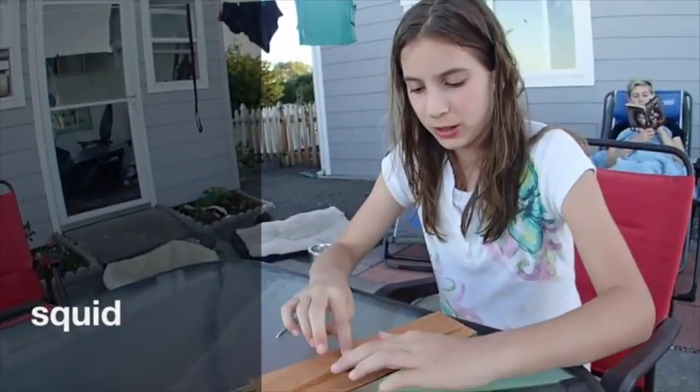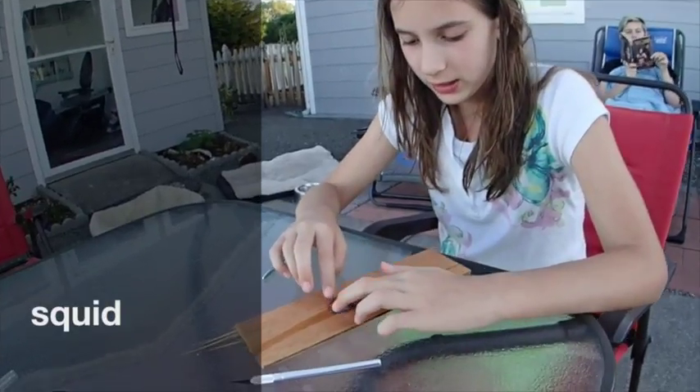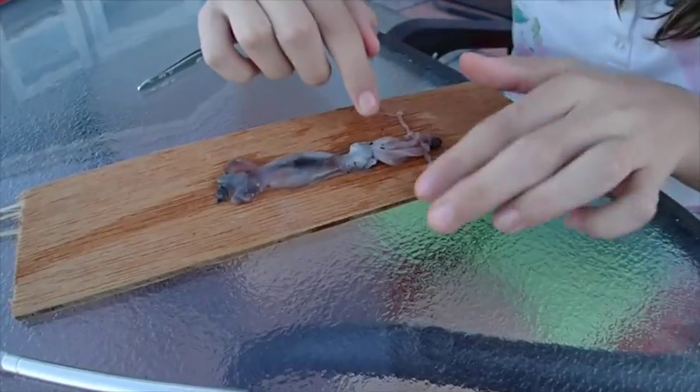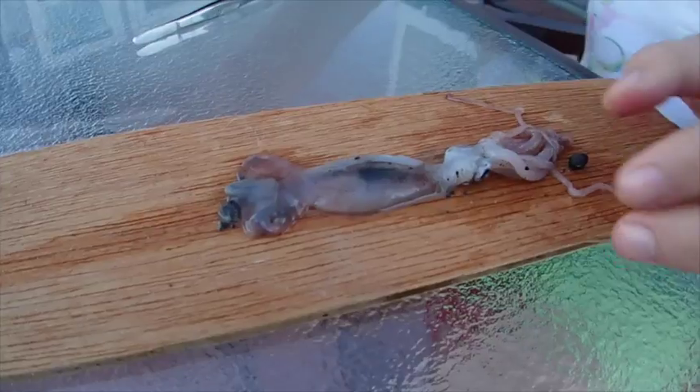We are going to be dissecting a squid, and I have one here. It looks very disgusting — it's dead. Those are its eyeballs, that is the ink sack, and we're going to cut it open.